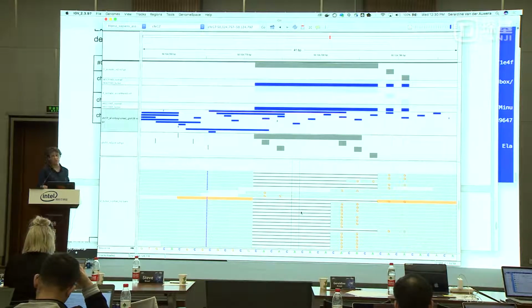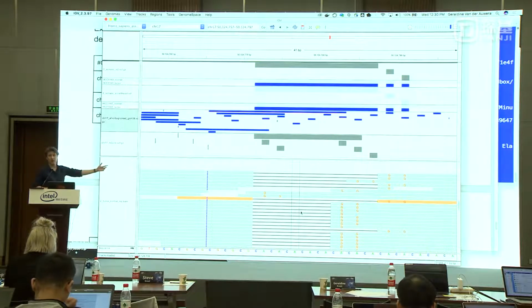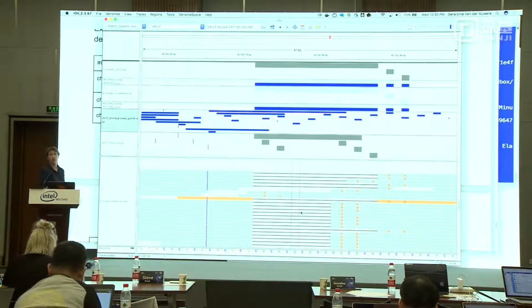And the filtering will help a lot, because as you can see, something like this gets filtered out. But there will be cases that are more ambiguous, and that will require a lot of manual review. And hopefully, this gives you kind of a jumping off point, but there will be a lot of work beyond that that you can go on.